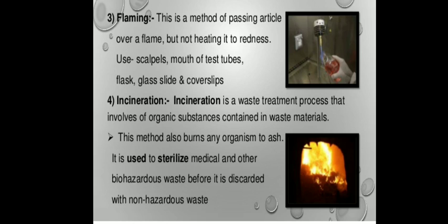And this method is generally used to sterilize medical and other biohazardous waste before discarding.